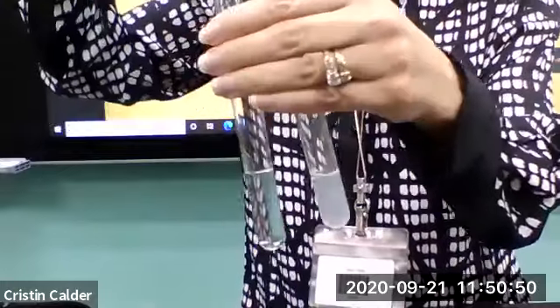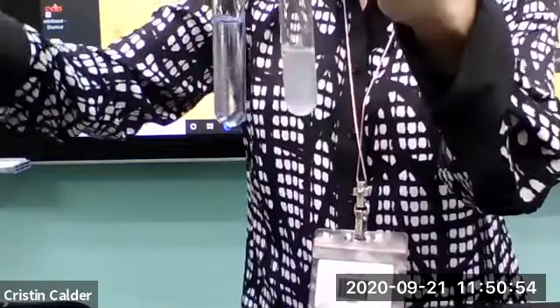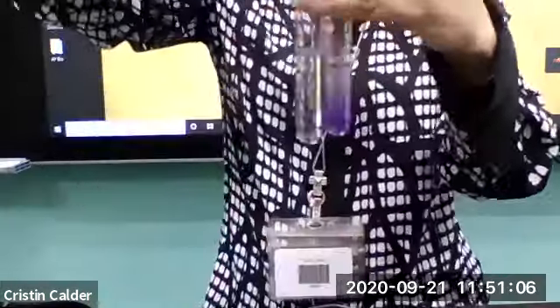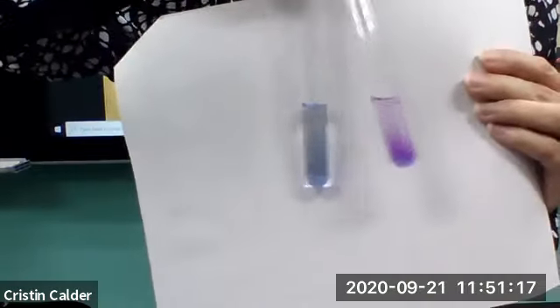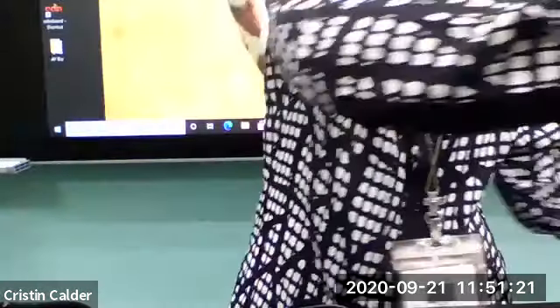So, all right, here's my Biuret in my water. And here's my Biuret. I'll probably need to put this against some white paper so you can really see it. And here's my Biuret in my protein. Hopefully you can see the difference here. So in a protein solution, the Biuret is going to give us, this is our standard right here, our positive test. Notice it's purple. And our water, our negative test, is just blue. All right, so that's our protein test.